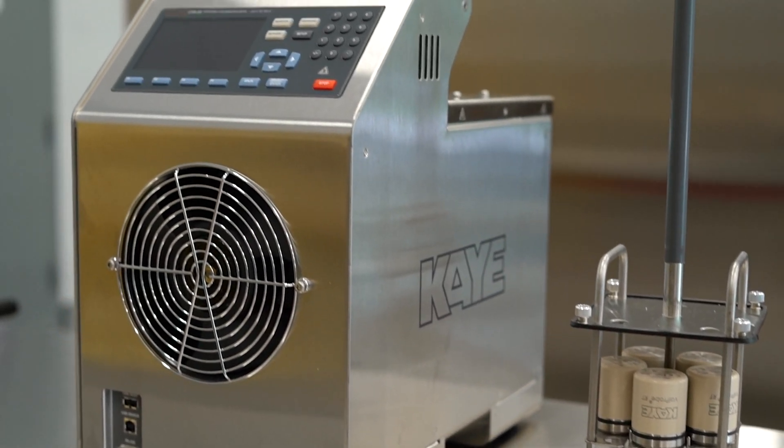CTR25 is very unique because it can cool quickly, yet it does not have any compressors, making it portable.